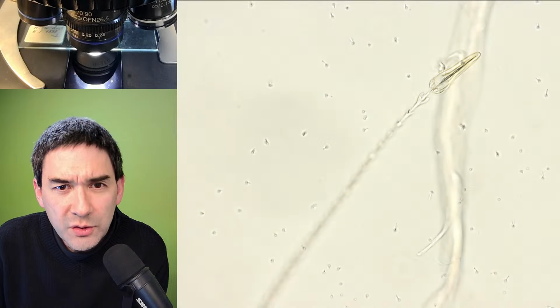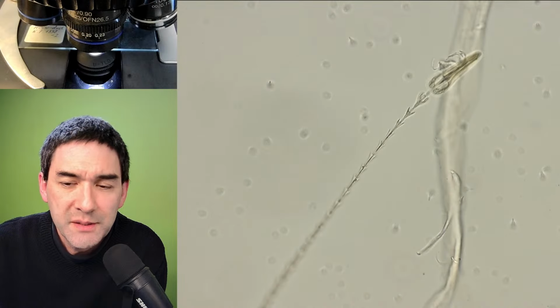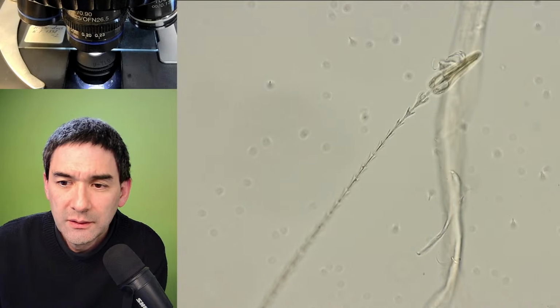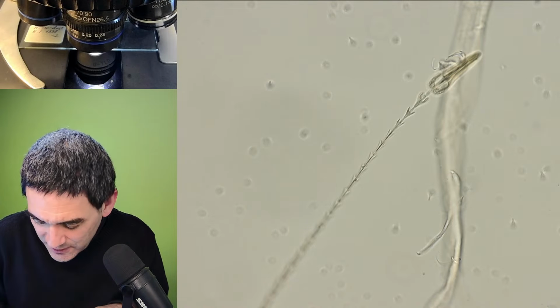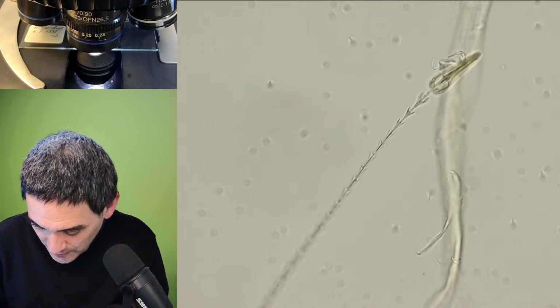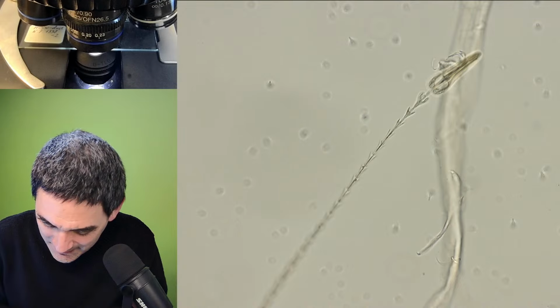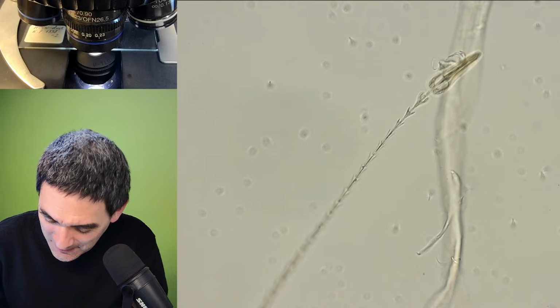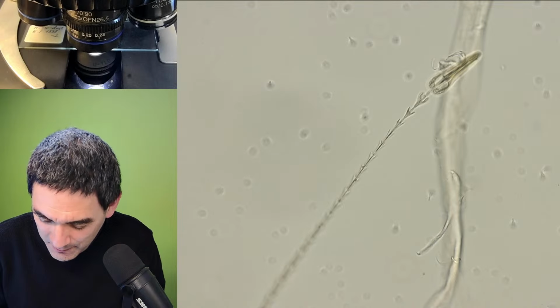So dust can be quite an interesting specimen. I made a couple of drawings, but then I stopped drawing because it was very time consuming. At that time I didn't even have a webcam.